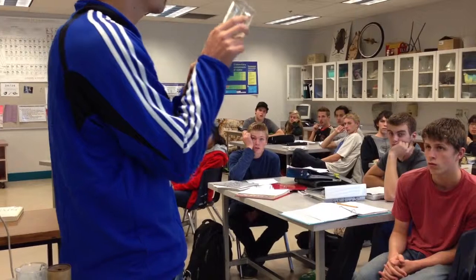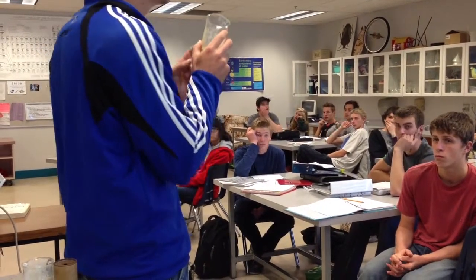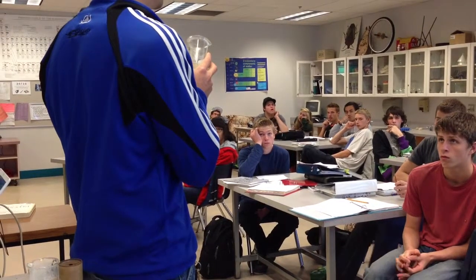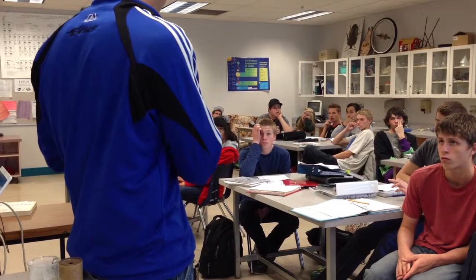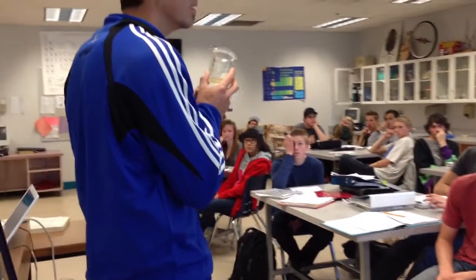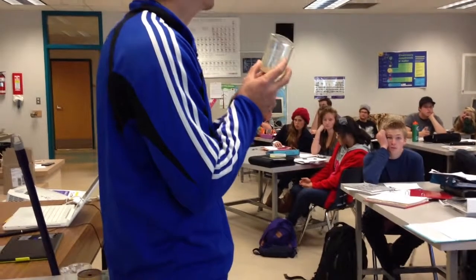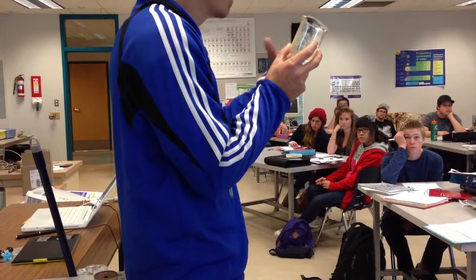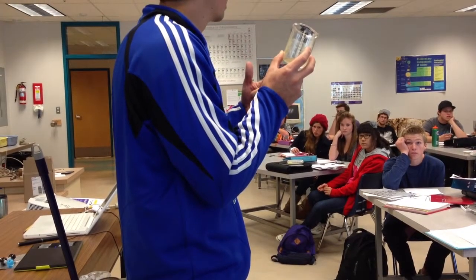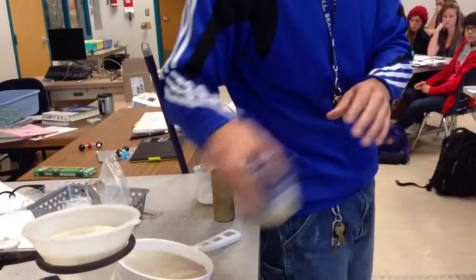Now, there's a slight exception. Is this clean-looking water? No. There was a type of solid that went through. A solid that when it's with water isn't really a solid anymore. It's not because it melted, it's because it dissolved. Okay? So dissolved solids can go through. What's a name for something that has a dissolved solid in it? Solution. Okay? So solutions will go through, solids get trapped.